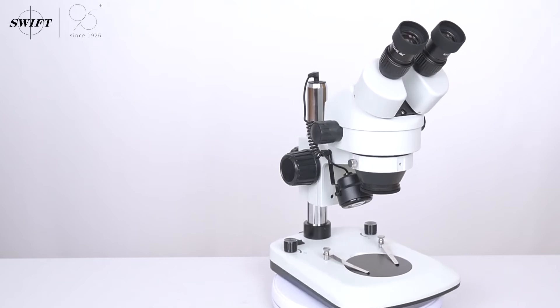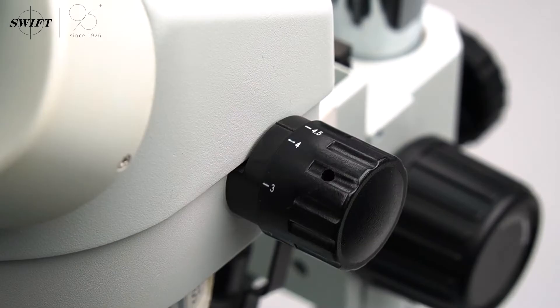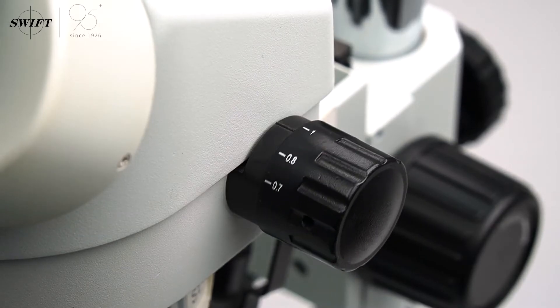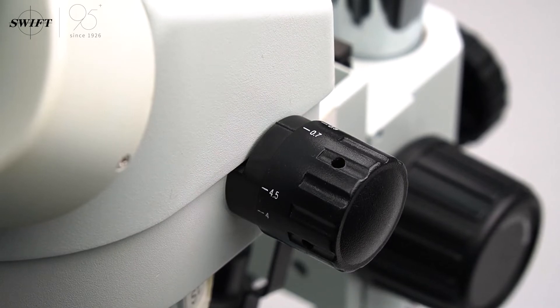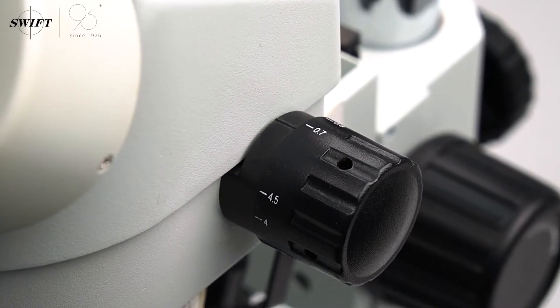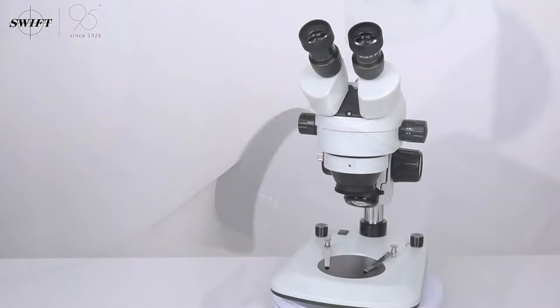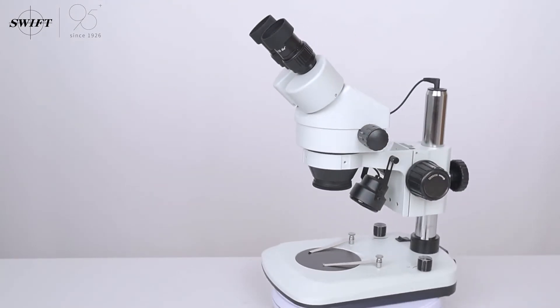This is a continuous zoom binocular stereo microscope. The system magnification is 0.7 to 4.5 and the zoom ratio is 1:6.4. The model is suitable for professionals and amateurs.